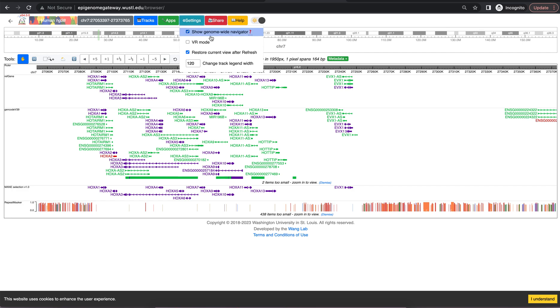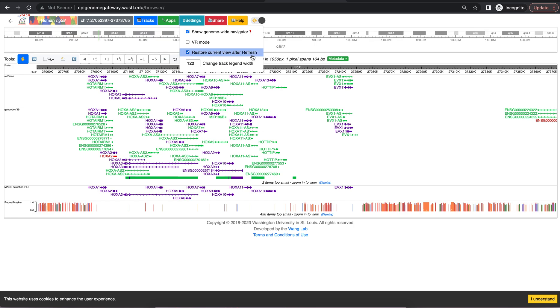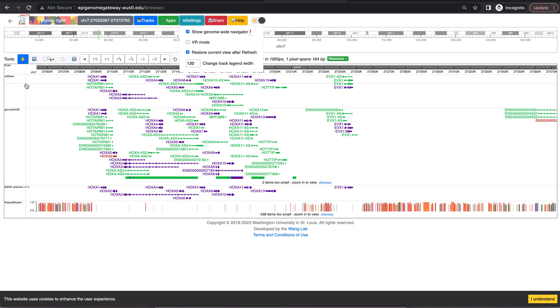Settings has a few features such as using the genome-wide navigator seen here to jump around to different regions of the genome. You can also have the current view refresh after you refresh the page. You can change the current track legend width using this option where you can adjust the legend name to have a longer name or a shorter name.